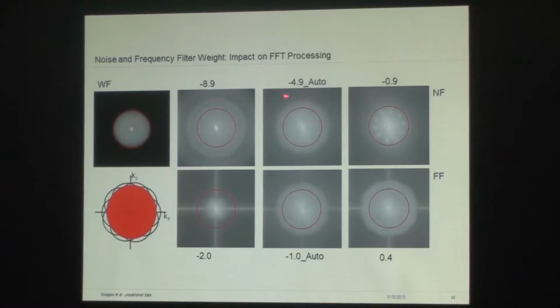But when I do, what I did is I just go 4 digits lower and 4 digits higher towards positive and negative from the center value. And as you can see in this picture, I lost most of the low frequency information, but I have amplified the high frequency when I go more negative. And when I go towards positive, I amplify the low frequency higher than what is actually there, and I suppress the high frequency information.